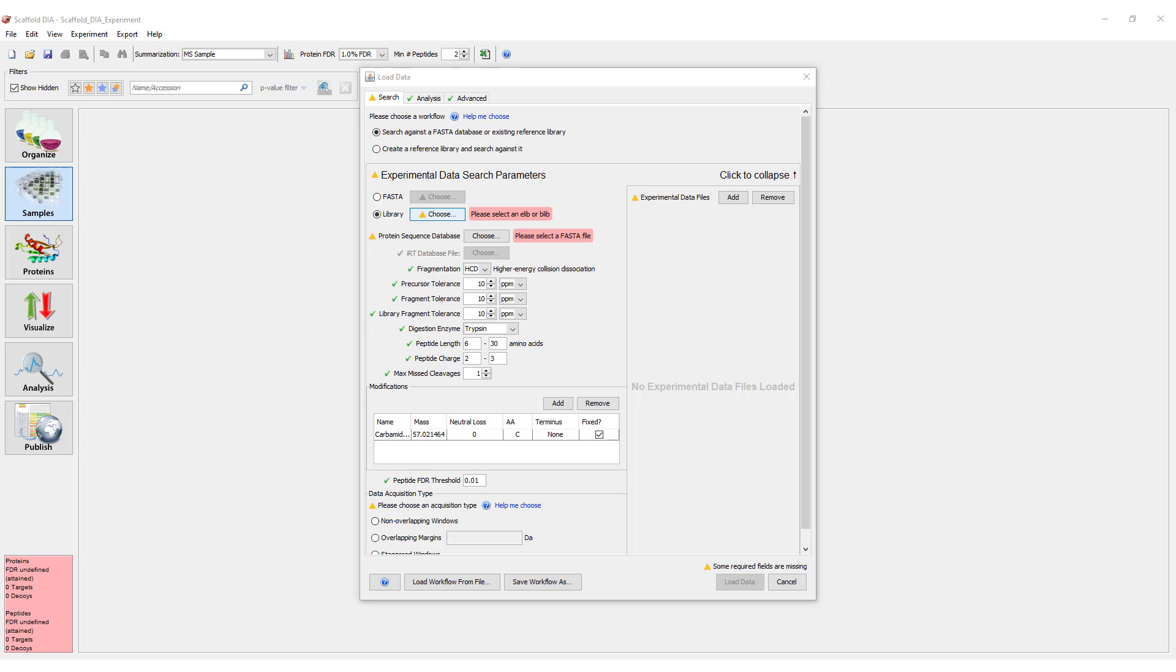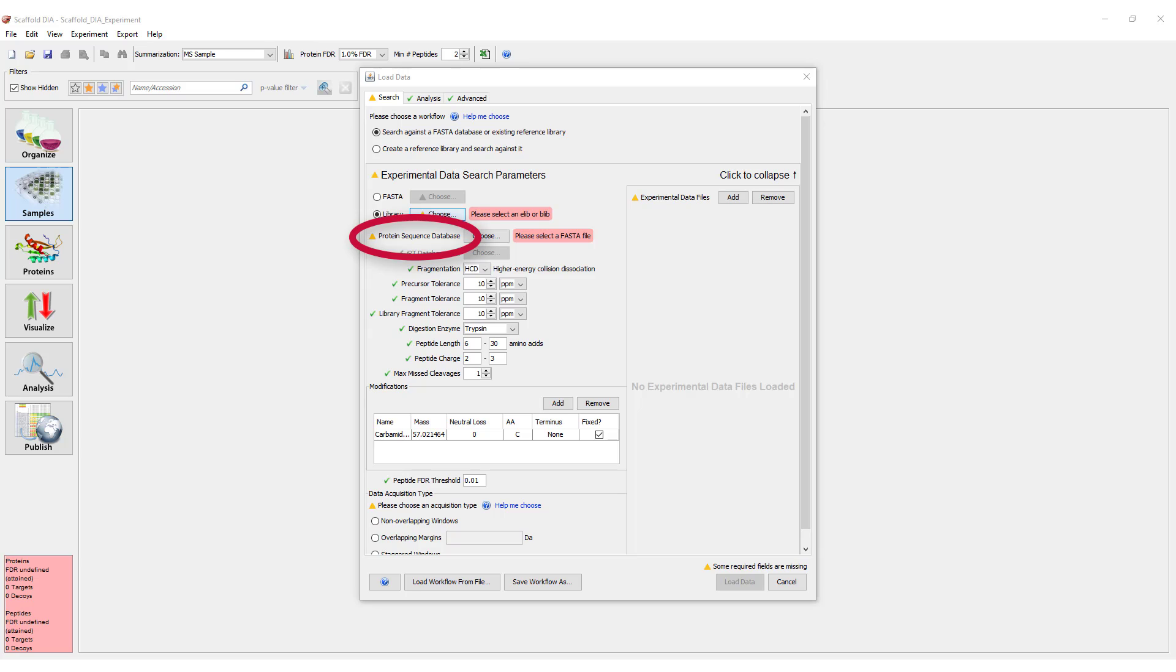First, we must choose the library we would like to search our data against. The FASTA option here will search your experimental files against a FASTA protein sequence database. The library option will allow you to search against an existing Blib or ELib. Note, if you choose to search against a library, you still must provide a protein sequence database in the form of a FASTA file.